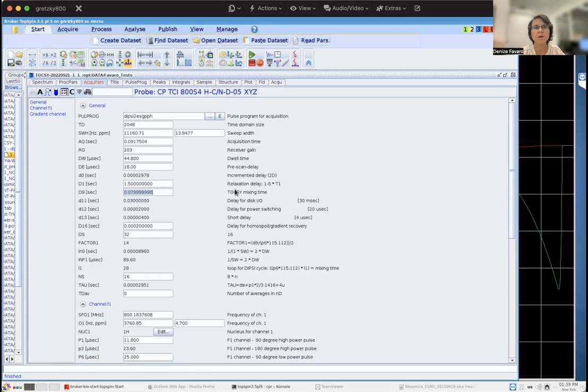Of course you won't use more than 80 milliseconds, because it starts to have lots of relaxation, since during the transmission of information my magnetization is on the transverse plane. So that's the usual range, 20 to 80 milliseconds. Most of the time you acquire either one 80 millisecond experiment, or 2 experiments, 20 milliseconds and 80 milliseconds. So you can pretty much discriminate which hydrogens are close and which are more distant in the spin system.